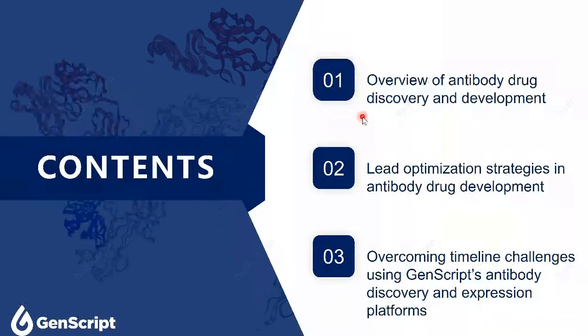It is my pleasure to be here to share how to overcome the timeline challenge in antibody drug discovery. In today's webinar, I will first talk about the overview of antibody drug discovery and its development process. After that, I will share some of the lead optimization strategies in antibody drug development. Lastly, I will discuss how to overcome the timeline challenge by using our GenScript antibody discovery and expression platforms.